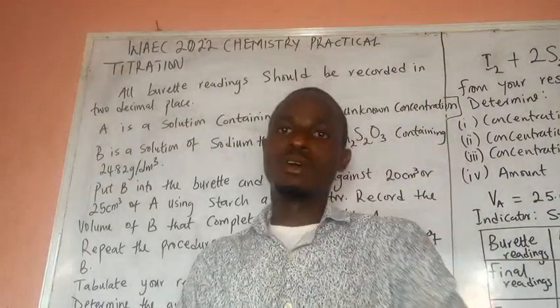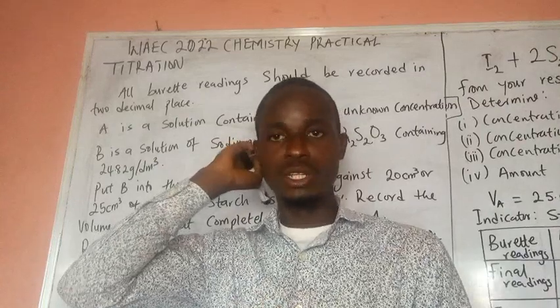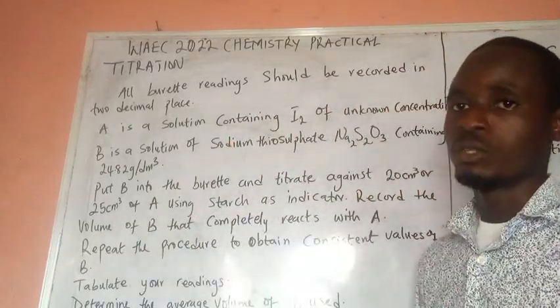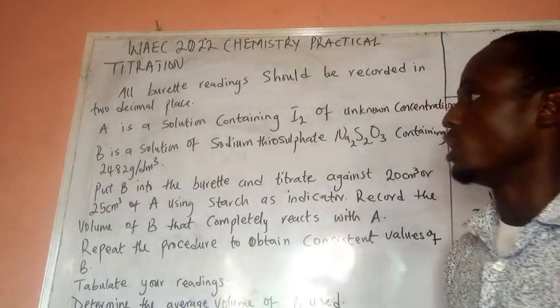Welcome to this channel. We want to look at the WAEC 2022 chemistry practical titration, that is quantitative analysis. So let's look at the question. We have all burette readings should be recorded in 2 decimal places.